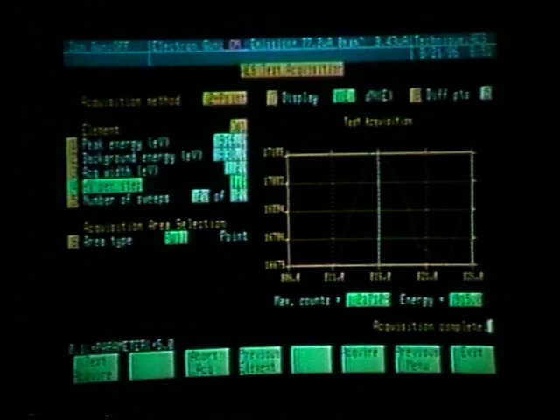So again, that is a disadvantage of the 2-point or 3-point profile. Any elements that are not on the surface are very difficult to set up for. Whereas in the window acquisition, we can set up for those elements with a wide window, and it doesn't matter how that peak shifts if the energy is not exactly where it should be. If there is a 4 or 5 volt shift, with a wide enough window in window acquisition mode, we will still be able to evaluate the data and obtain valuable information.